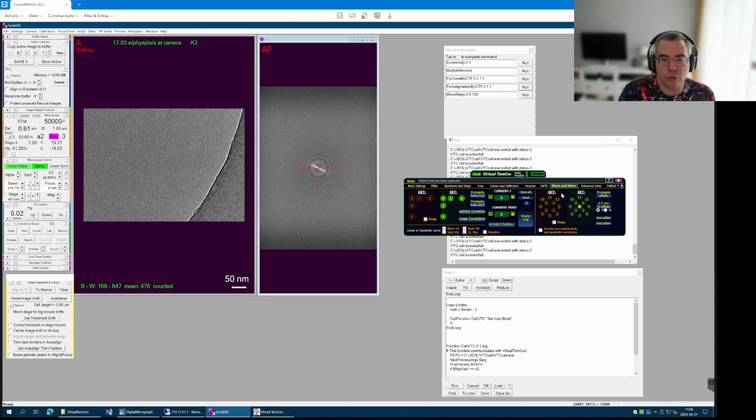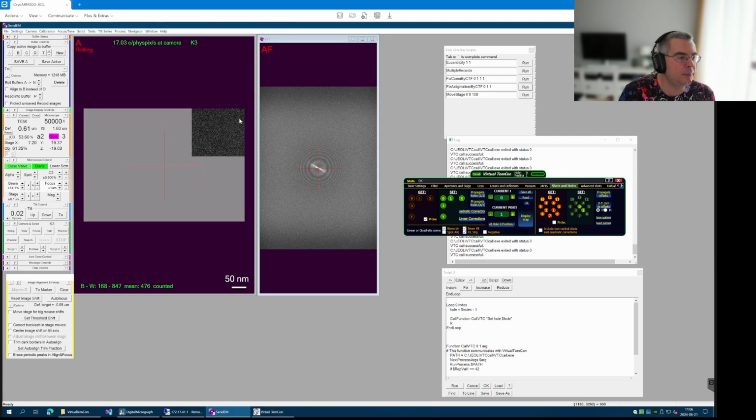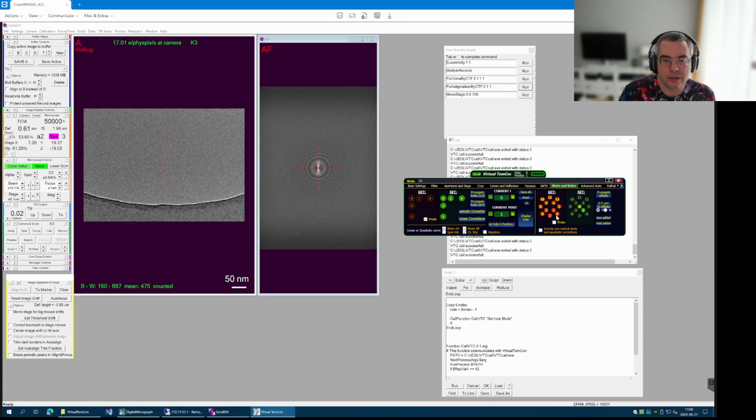And then we go to the shots and holes, the right side, we unprotect the positions, and we get position 1. So that's remembered. And then maybe let's go to the other end. Yeah, so that's the bottom end, so to say. So let's take another record here. Yeah, looks good. So we save it as position 2.